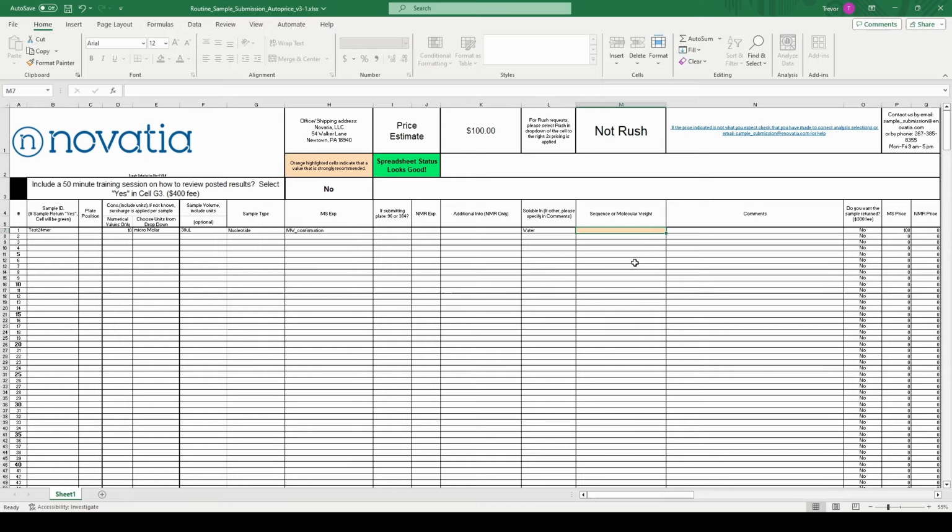However, if you do request high res, we ask that you provide monoisotopic masses for your samples. If you do provide a biosequence, please provide the modifications in the comments. For example, if you provide a sample with a black hole quencher, you put your modifications with BHQ, and then you put the mass or the link of where you purchased this modification, or how you synthesized it, or perhaps the structure of the modification so that we can add it to our database to look for it.